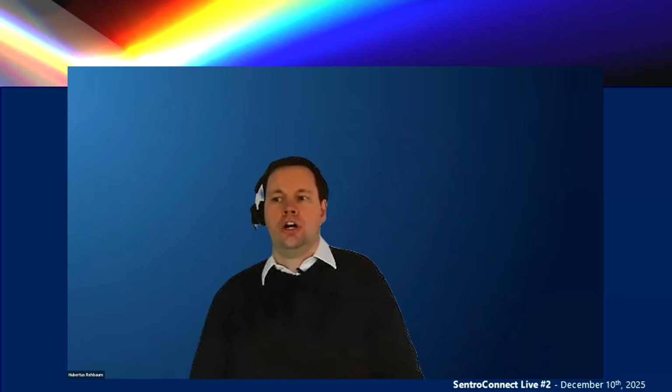We do have one question asking, what is the benefit of using NIR in the feed frame versus in the mixer, or let's say, slash the bin blending stage, reminding here that the first SentroConnect Live was on bin blending. Owen, I can see you unmuted if you want to start off with that.